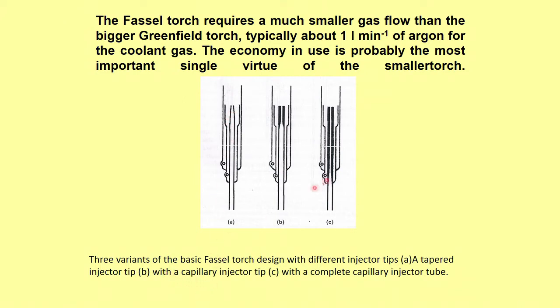And second one has become a little thicker here near the top. So, it becomes a sort of capillary injector tip, only the tip is made thicker, so that the sample comes out of a capillary, that means the sample quantity becomes smaller here. So, that is an improvement in this.